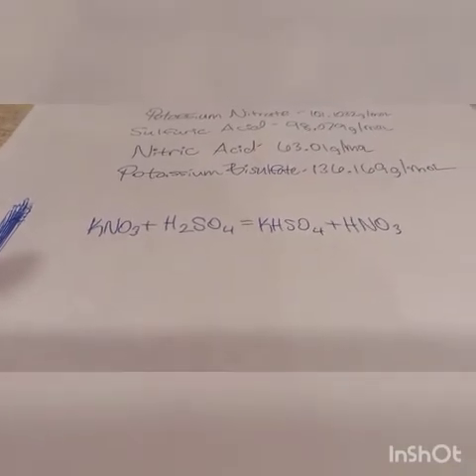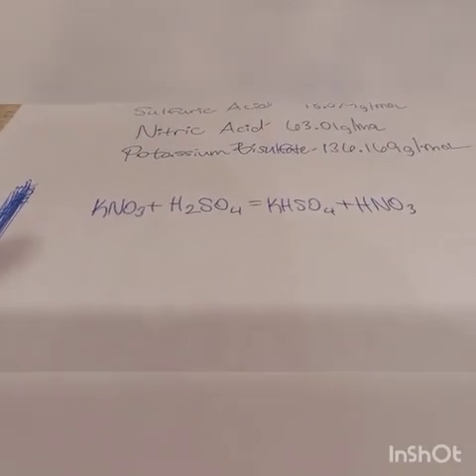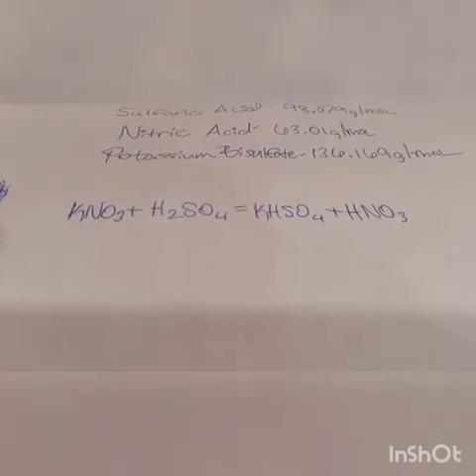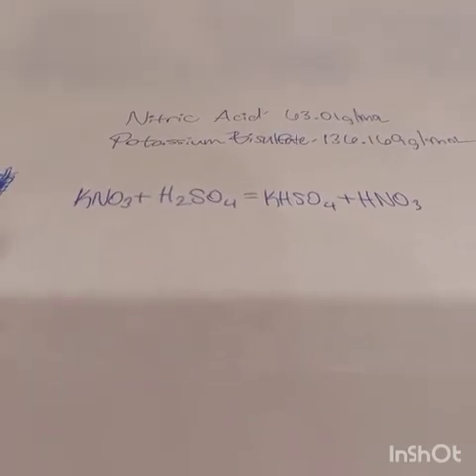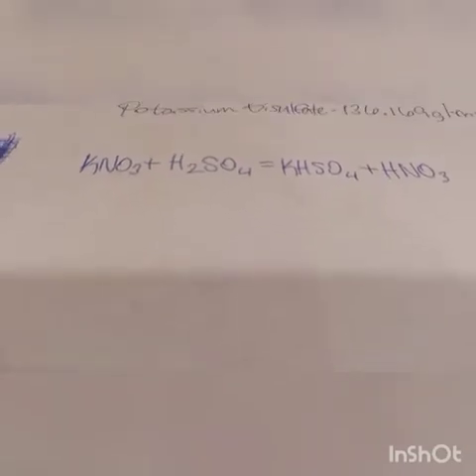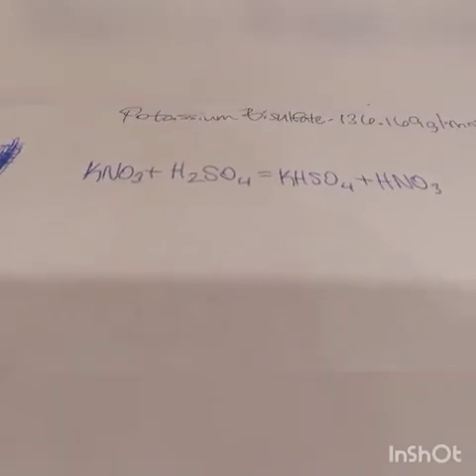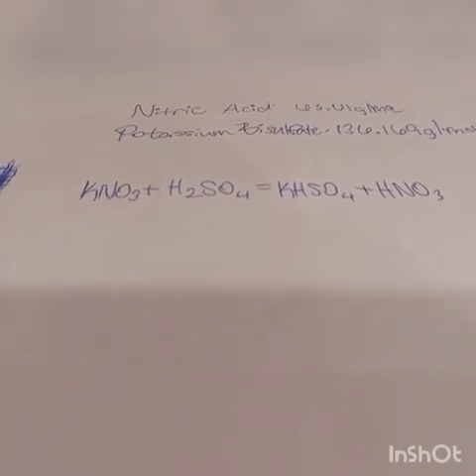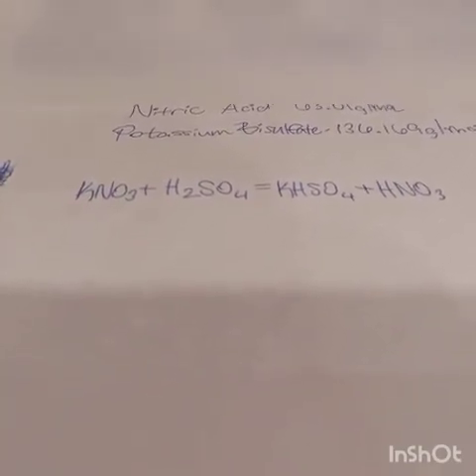Alright, KNO3 plus H2SO4 equals KHSO4 plus HNO3. Alright, we're gonna go ahead and do the video. Basically what I've done here is just made a few clips of the process. This is my first video. It's probably going to be kind of crappy, but here it is.